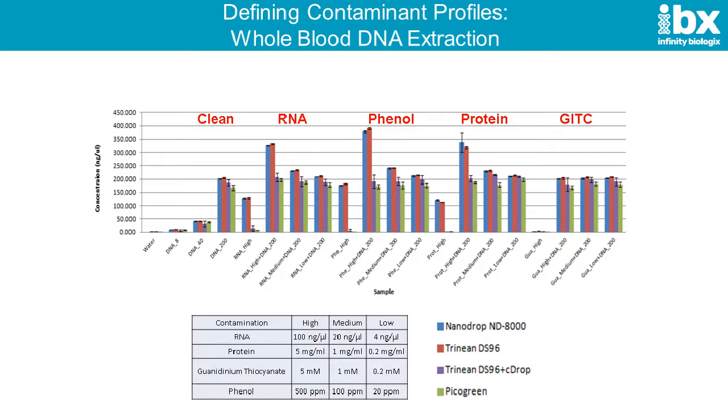And this is likely one of the largest reasons for omic failures in analysis. You look at microarrays: if you've overestimated the amount of DNA that goes into the labeling and fragmentation, it is going to lead to poor results. If you overestimate the amount of nucleic acid that goes into a next-gen sequencing library, it'll lead to lower complexity and poorer results.